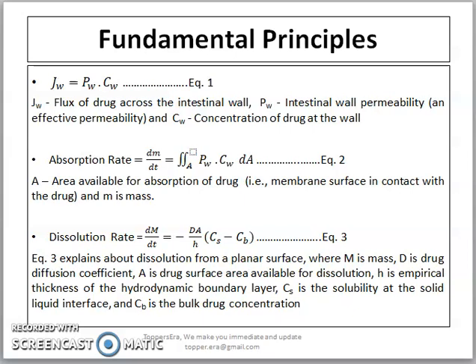There are several other equations published to study dissolution phenomena, but those are all more or less derived from these 3 fundamental equations.